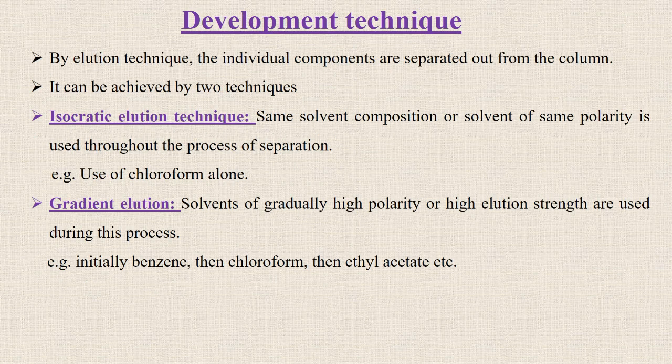Then there are development techniques or elution techniques. The individual components are separated out from the column. There are two techniques. First one is the isocratic elution technique. In this technique, the same solvent composition or solvent of the same polarity is used throughout the process of separation. For example, use of chloroform alone.